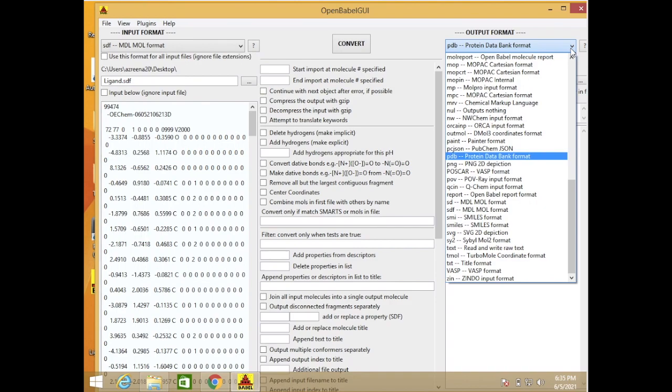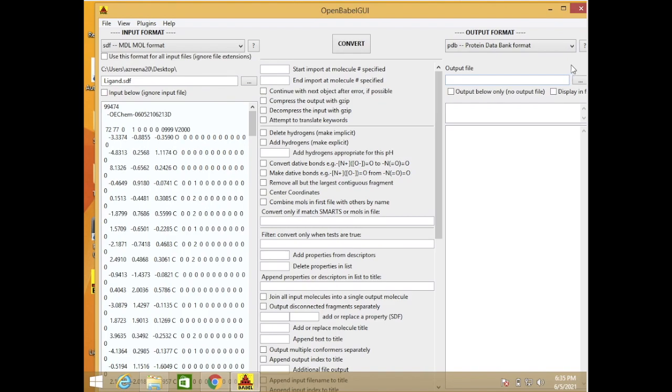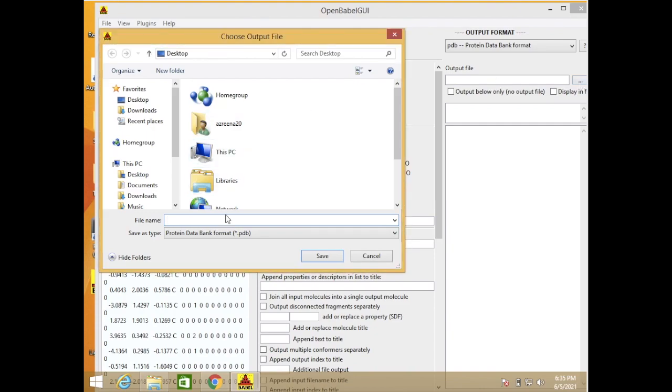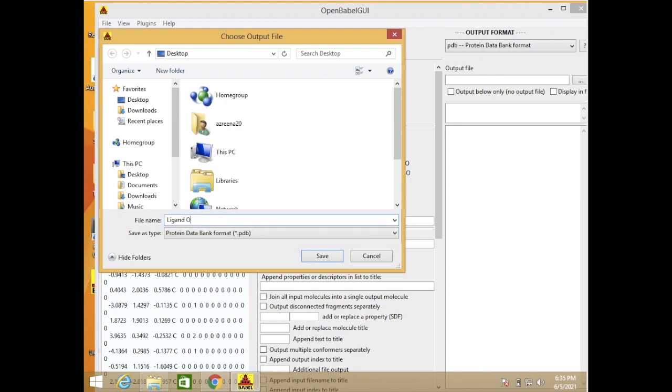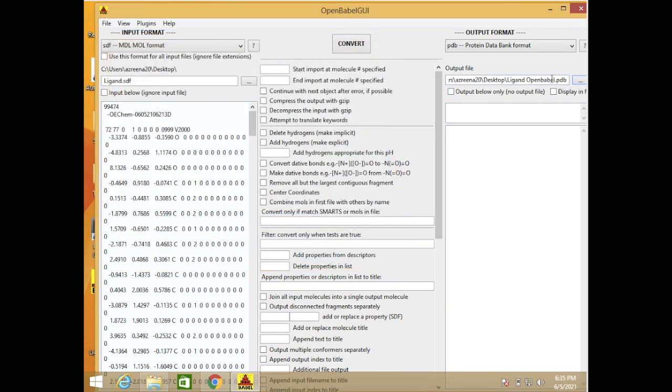And then also here we can convert into other types of files. For the output file three dots here, also click. I want to name it as ligand OpenBabel. So save. Our file will save into this name of files, so click the convert in the middle.